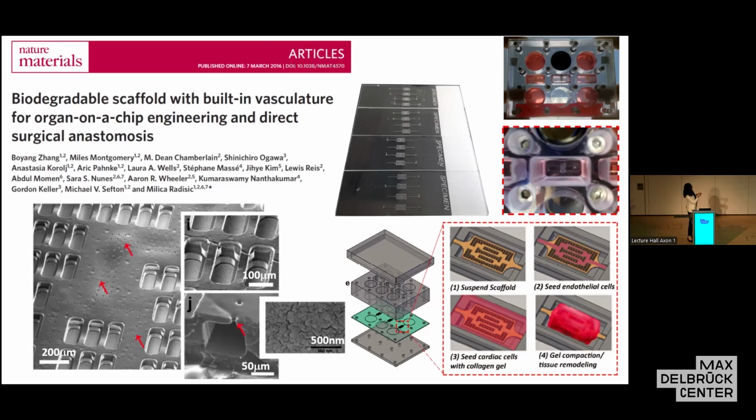So Boyang made a bioreactor that looked like a well plate. And each angiochip runs on a unit of 3 wells. Angiochip goes in the middle well here. If you put more media upstream compared to downstream, you will create a pressure head, and this pressure head will drive the flow. And these reservoirs are big enough that you're going to have unidirectional flow in angiochip. All you need to do is change media with pipettes, as you normally do.